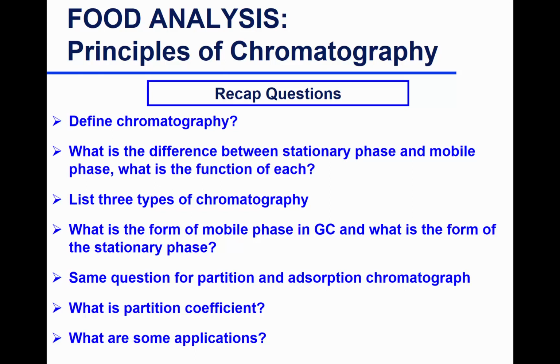Awesome. So stationary phase is the phase that, if you're using a column, or if it's planar, if you have a plate, either paper chromatography or thin layer chromatography, or a column chromatography. So the stationary phase is the phase that doesn't move and interacts with your constituents. So key is interaction. Your constituents are going to interact with the stationary phase, and the mobile phase is going to carry it along, move it along.